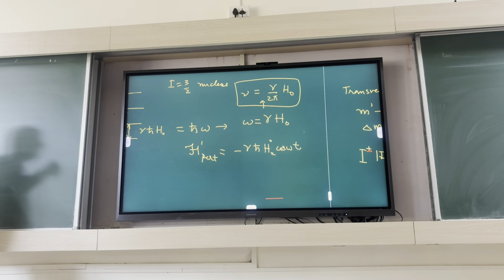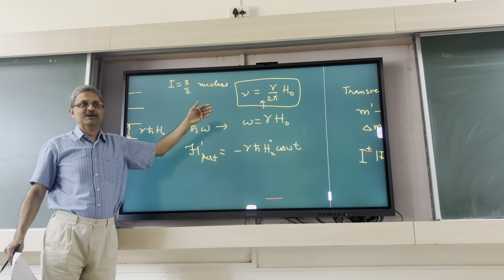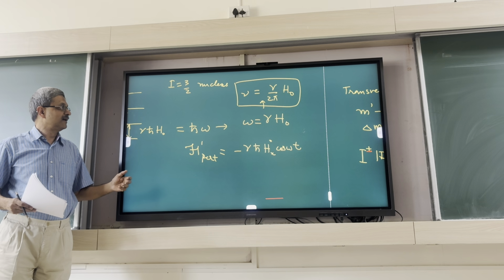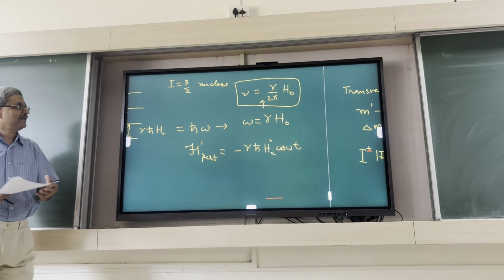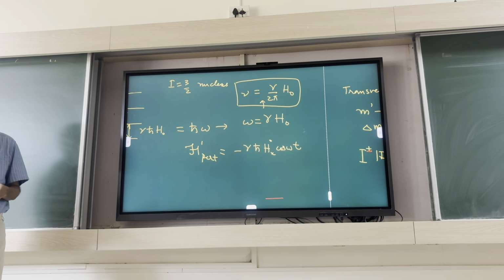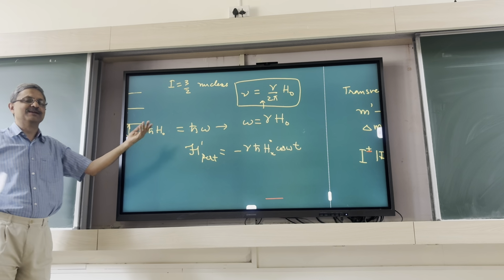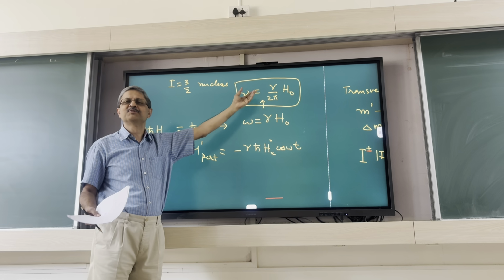So what is interesting is also that you have actually looked at a quantum mechanical problem. You have quantized energy levels, you have a Hamiltonian, and then you are saying there will be a resonance and so on. So there is H bar there in the problem. But in the final answer of what the resonance frequency is, the H bar has disappeared. Okay, so classical treatment of course has no H bar. So classical treatment also gives you the same answer.